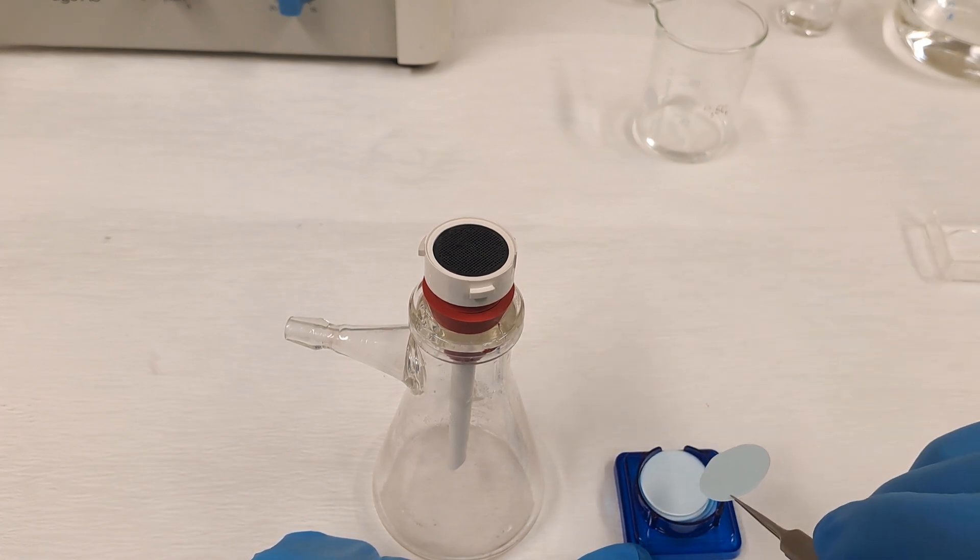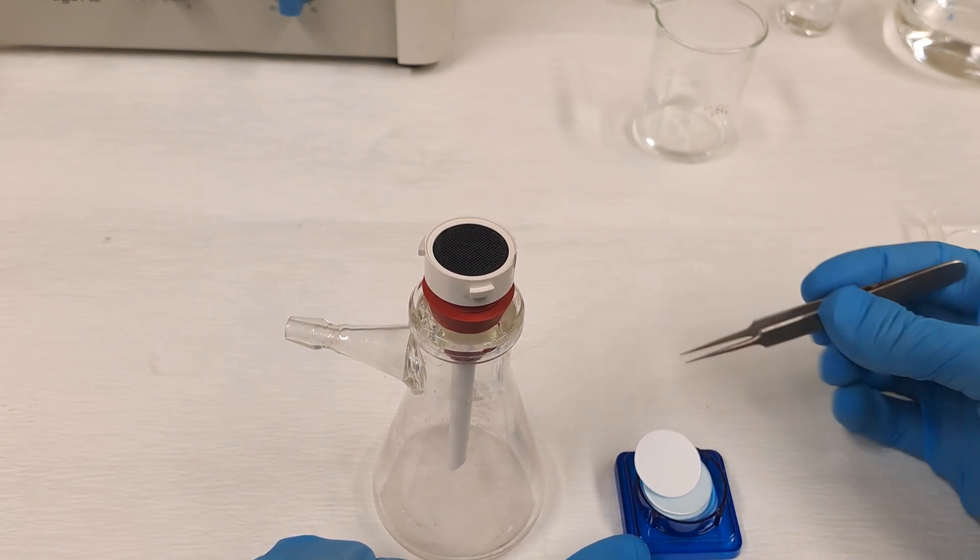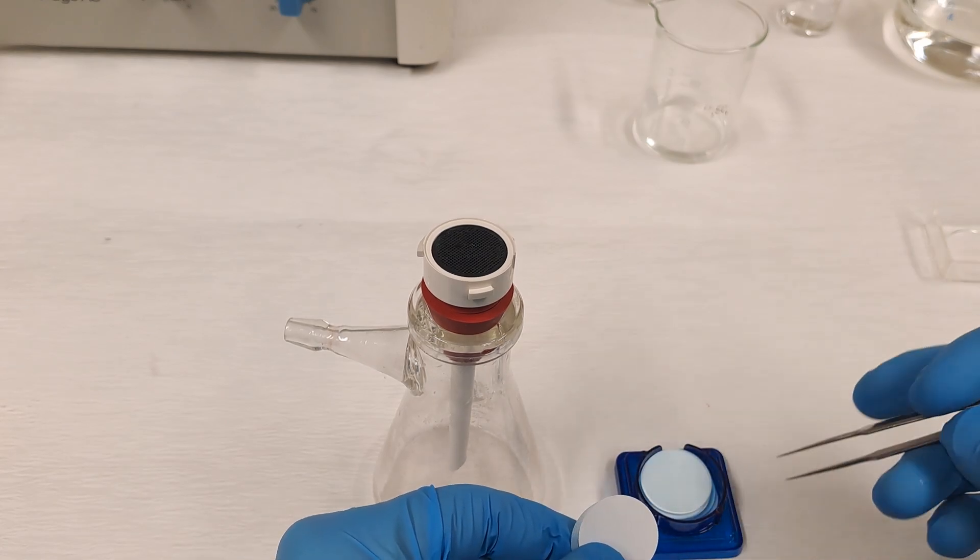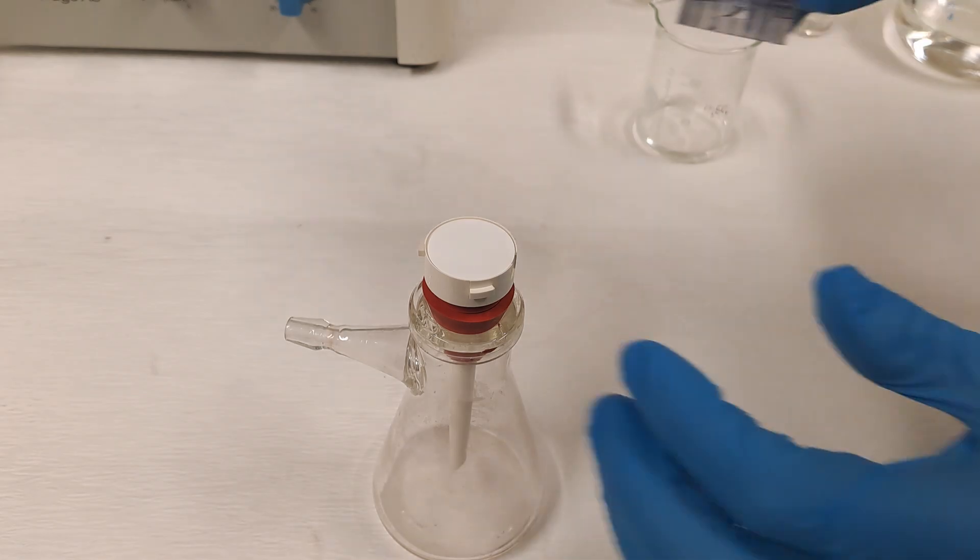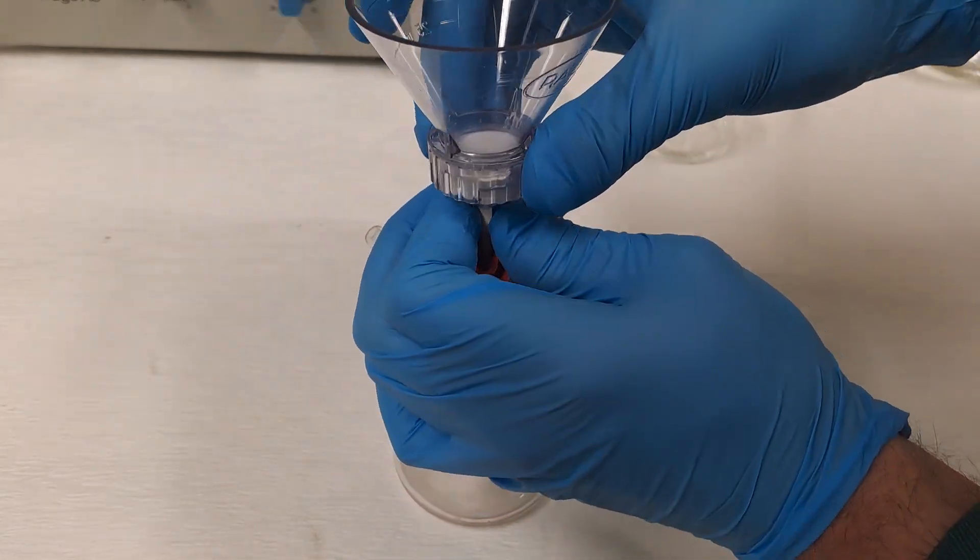The membrane filters are very fine and are separated in their packaging by these blue separator papers. Each filter has two separation papers, so make sure to remove also the bottom separator paper as well or the filtration won't work.